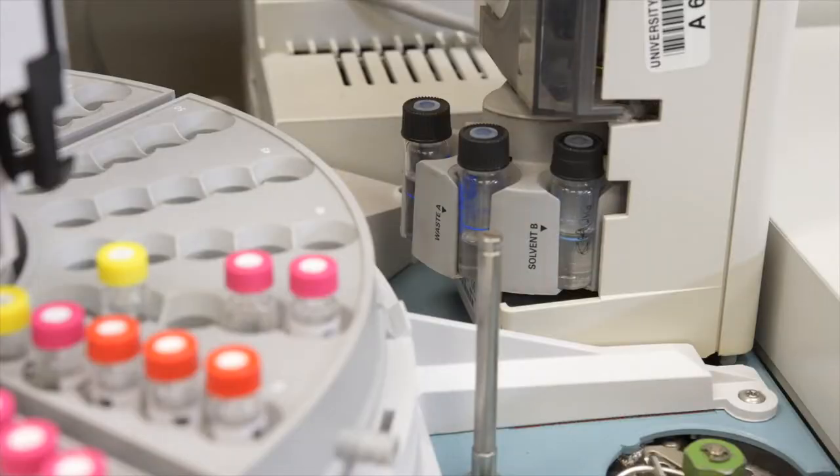I was working on quantifying the polarity of these lignin dimers that we make here in the lab. At first I was using octanol and water to do a classic separation — it's called a log POW separation. And then we moved on to do some work with an HPLC method, which was a little bit innovative and had recently been published. That's how I was able to quantify the log POWs.